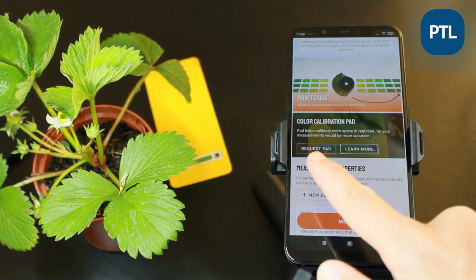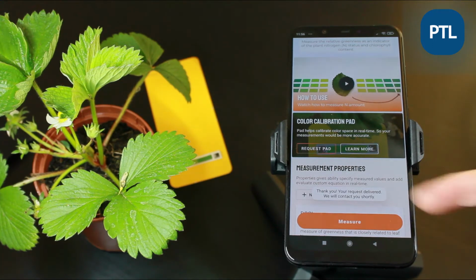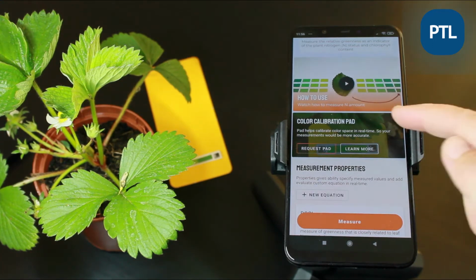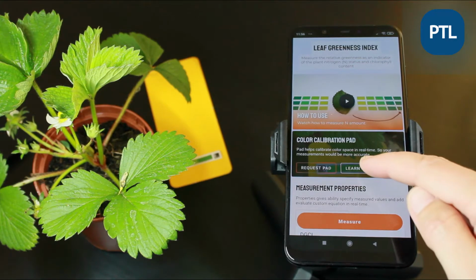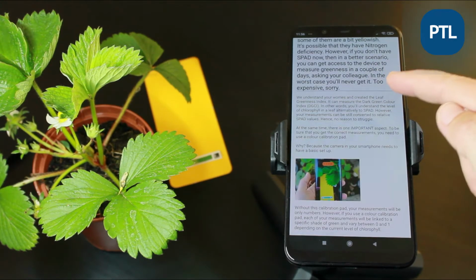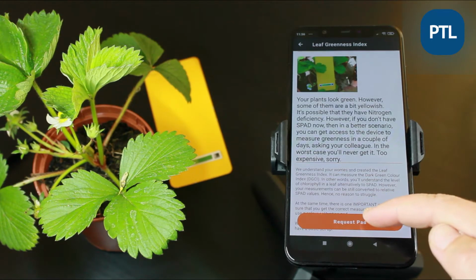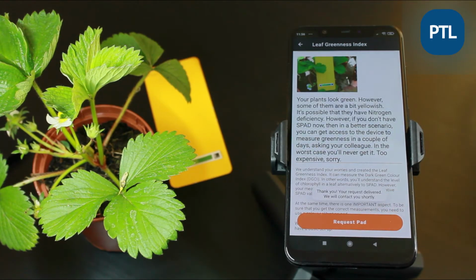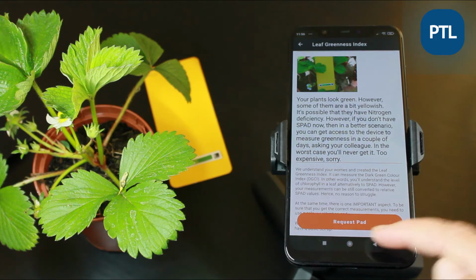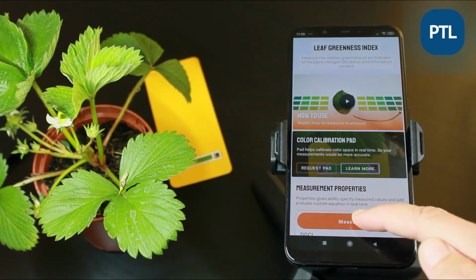For this experiment, we have the mobile application on our smartphone. Then we need to choose Leaf Greenness Index among the modules of Petiole Pro. You can see different available options, and one of them allows you to get the Colour Calibration Pad. This is an important accessory of Petiole Pro, and you will see it in action today. Also, you can get more information about the Colour Calibration Pad by pressing the button Learn More.